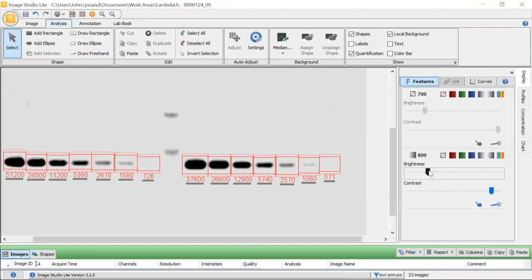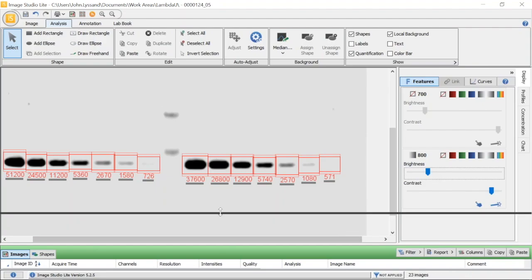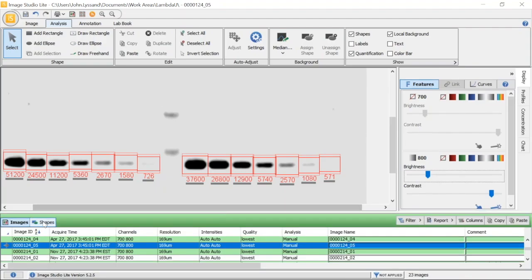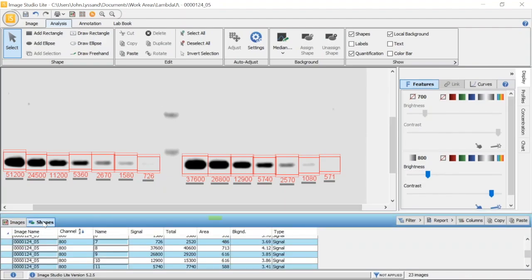In addition to appearing on the image, quantification is also listed below in the table here, the shapes table. In this table, we have all the pertinent information associated with the analysis.